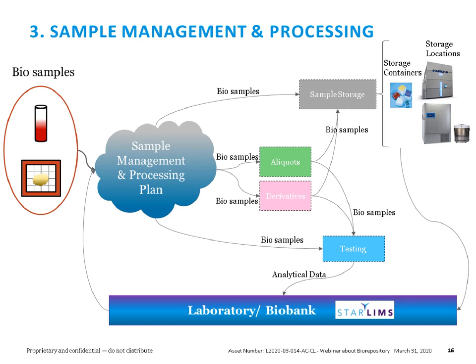Perhaps we could just receive samples that all they need to be done is to be put in perhaps a storage container, and from there they may need to be put into a -80-degree storage location, for example. And so being able to give them that reminder, these are the samples that need to be stored, it's important. But also there could be other different workflows based on the sample management and processing plan.